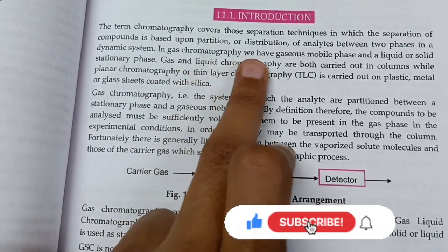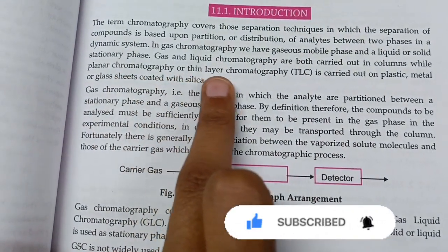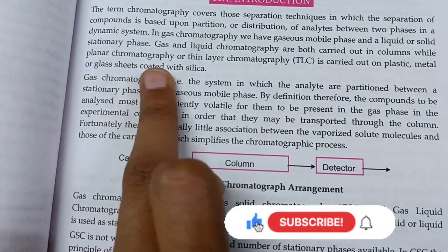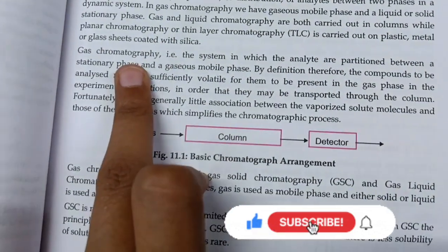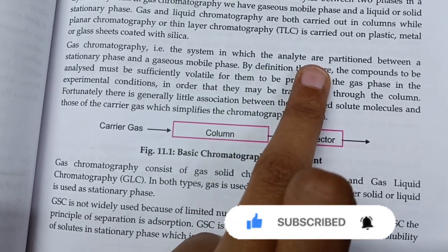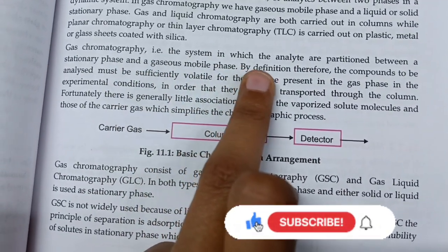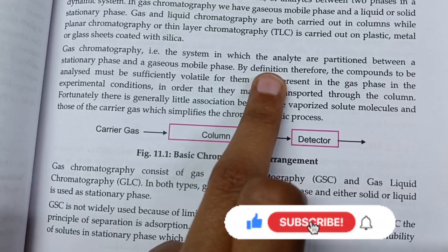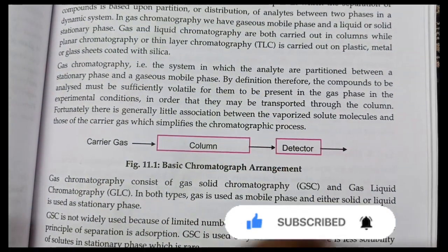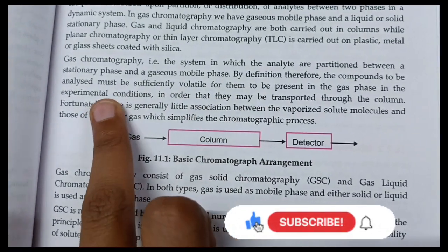Gas and liquid chromatography are both carried out in a column, whereas planar chromatography or thin layer chromatography is carried out on a plastic, metal or glass sheet coated with silica. In gas chromatography, the analytes are partitioned between a stationary phase and a gaseous mobile phase by definition. Therefore, the compounds to be analyzed must be volatile and present in the gas form in the experimental condition.